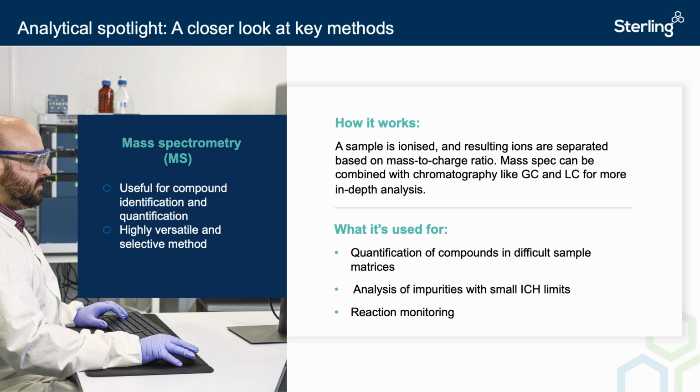Typically, a sample is introduced to an ion source, which causes the material to become charged, either positively or negatively, depending on the source and what works best in the analyte, or it breaks up into charged fragments. Both of our commonly used LC-MS ion source types work by aerosolizing solutions and evaporating the surrounding solution to form bare ions from the compounds of interest.